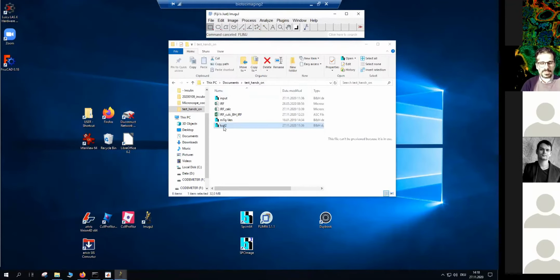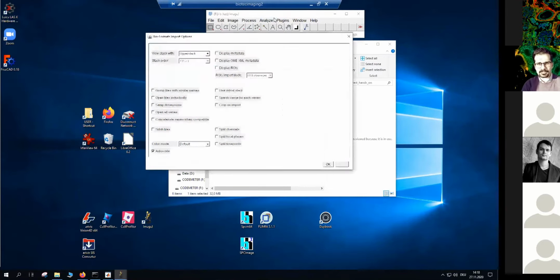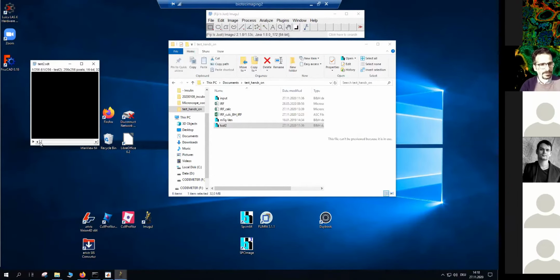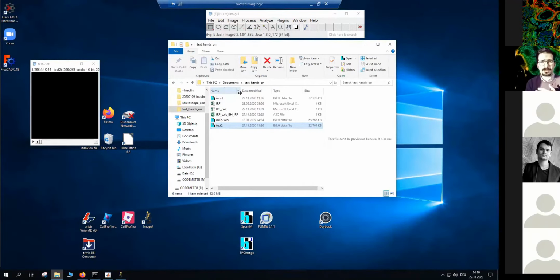Okay, let's go with this test 2, which is, as I said, the test image that you can find on the FLIM-J repository. So I just open it, and this is what we see when we open an SDT file. This is actual TCSPC data that has been saved, not by me, but by the person who acquired it. Unfortunately I didn't find any information about it, what kind of cell line it is, what we are actually measuring, or what these changes in the lifetime are. It would be interesting to have more information about this file on the repository.